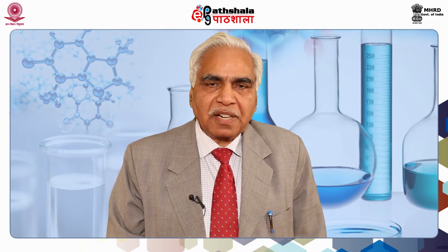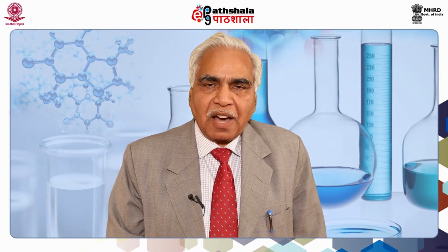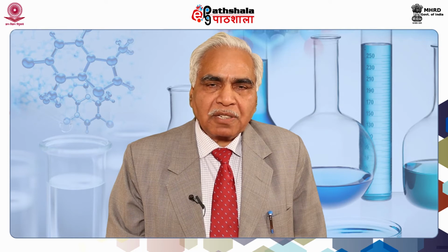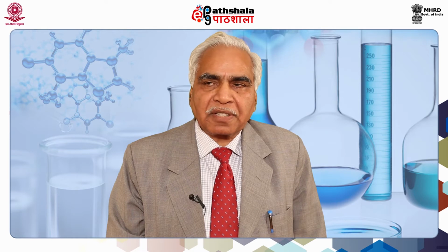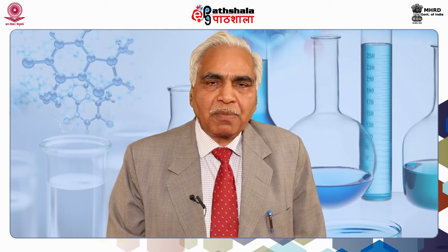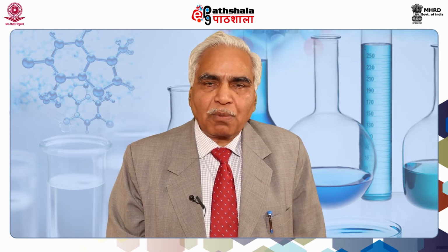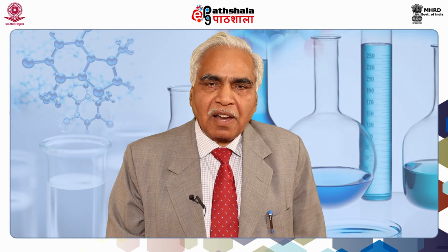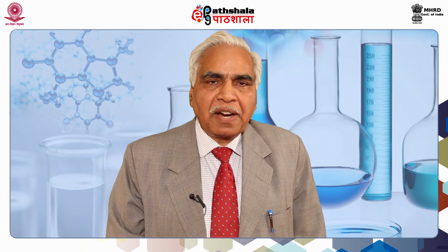So we will see how this technique works for the separation of not only the large molecules such as proteins, but it also works for the small molecules. If we compare with other electrophoretic techniques, other techniques are used for separation of macromolecules such as proteins only. So that way, this capillary gel electrophoresis is unique, that one can separate the small molecules, one can separate the large molecules. Here in this case, we will see that the voltage applied is very large.